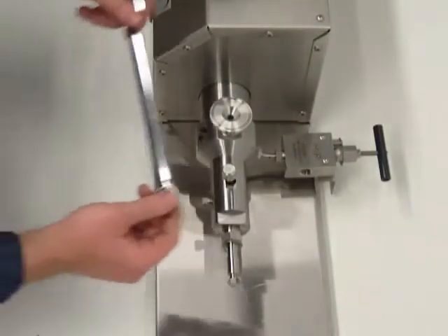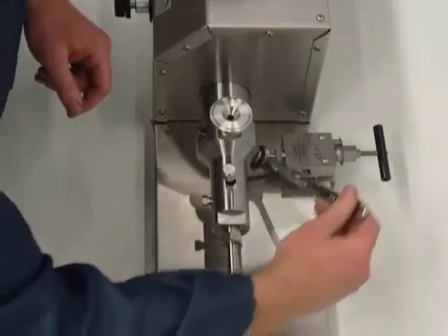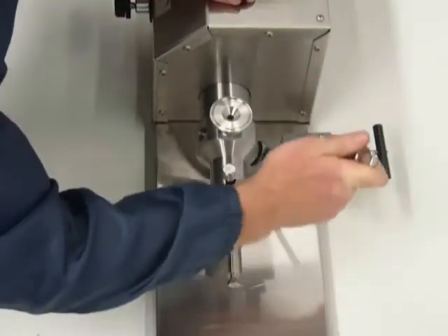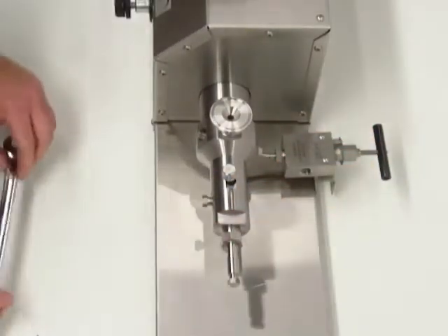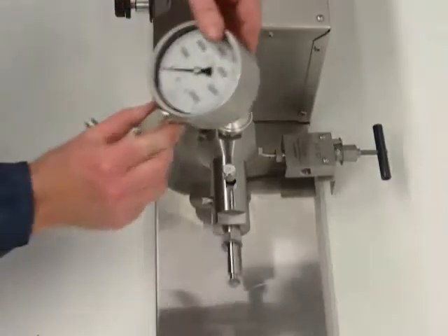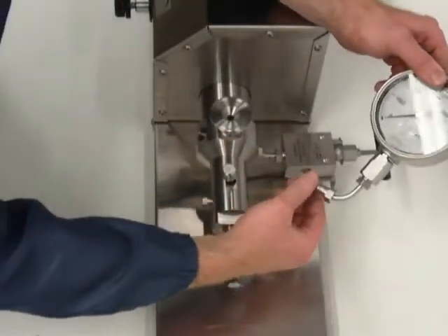Now we can tighten the gland with a 5/8 inch wrench. The next component to get installed is the high-pressure gauge. Again, check.